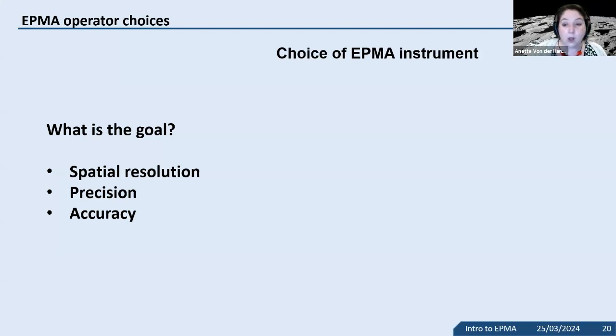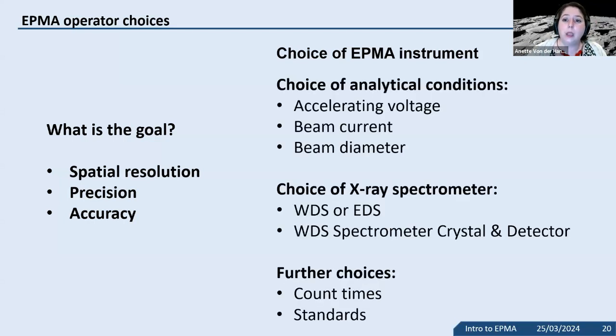It can help you see if the lab that you have in your department or that you have easy access to can even do what you are looking for. But then within an instrument, there are various choices that we have to make on a day-to-day level, depending on the materials and depending on the question, the application itself, what you're trying to analyze.